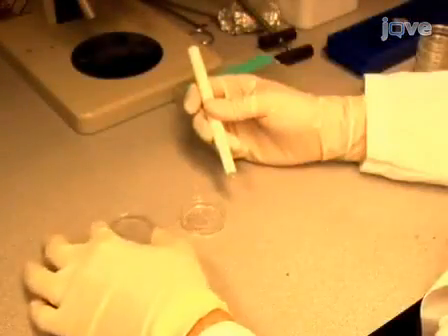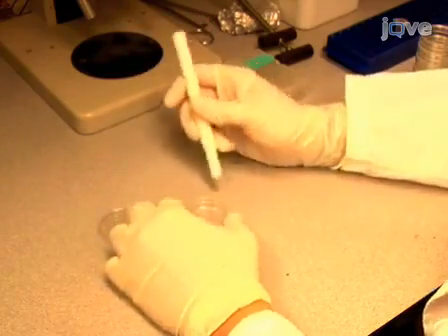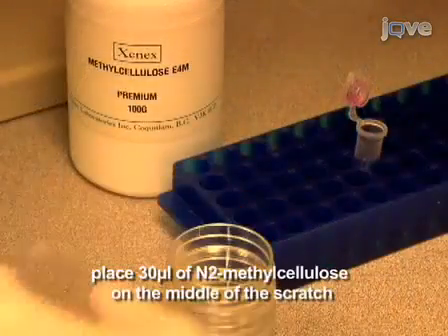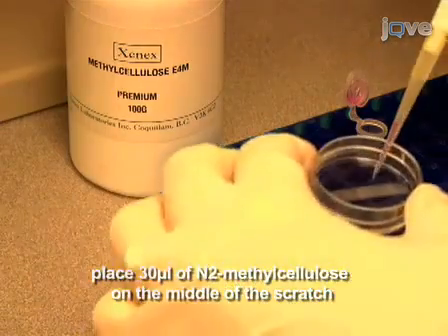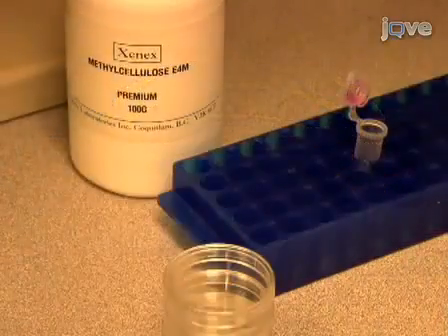After two days, make a scratch in the middle of the collagen coated plates with a pin rake. Use an outward motion. Then, place 30 microliters of the N2 methyl cellulose on the middle of the scratch. Set the dishes aside.